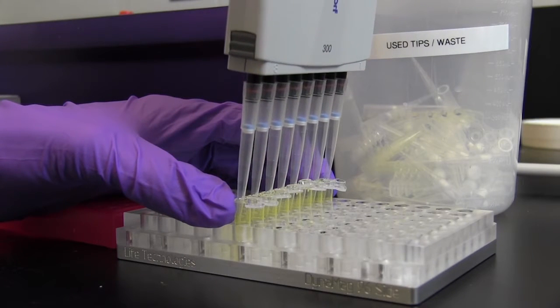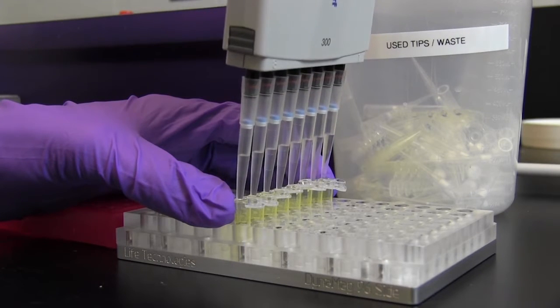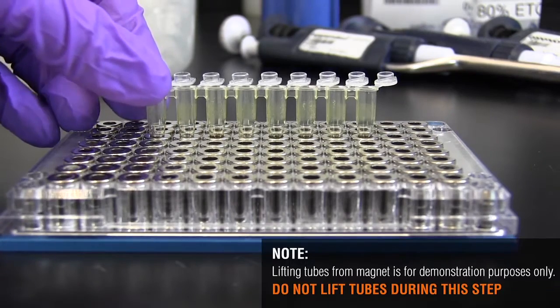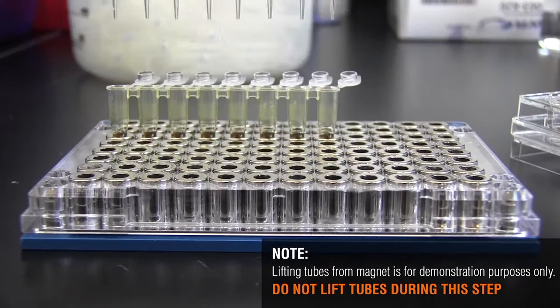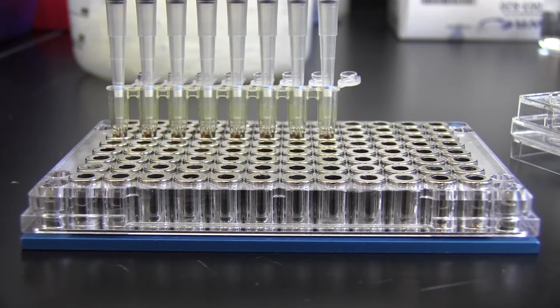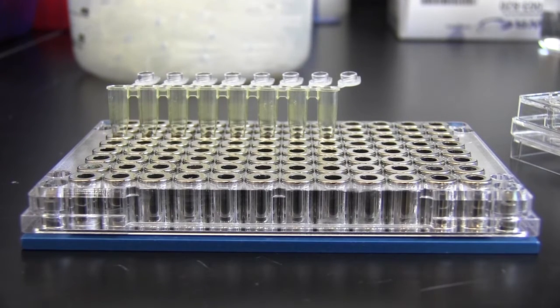Vertical bar magnets pull the beads to one side of the tube or well, and the supernatant can be removed by placing the pipette tip on the opposite side from the magnet. Plates with circular magnets pull the beads uniformly to the walls, so the supernatant can be removed by pipetting straight down into the bottom of the tube or well, being careful not to touch the sides.